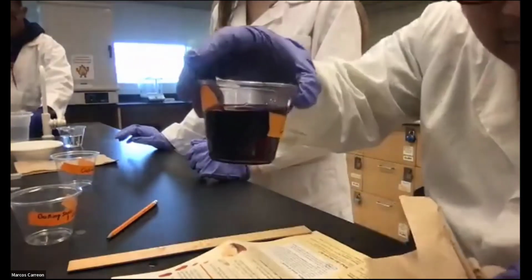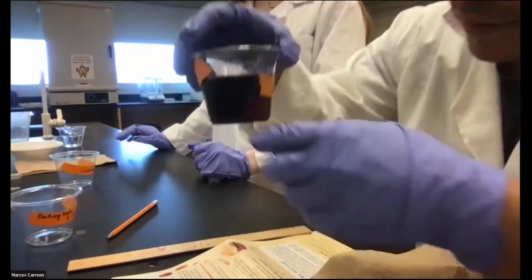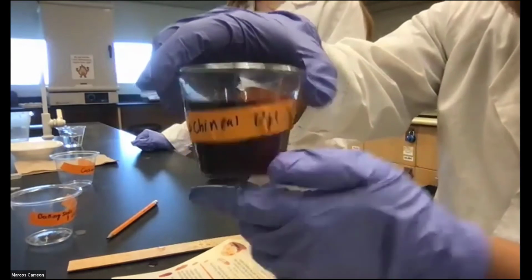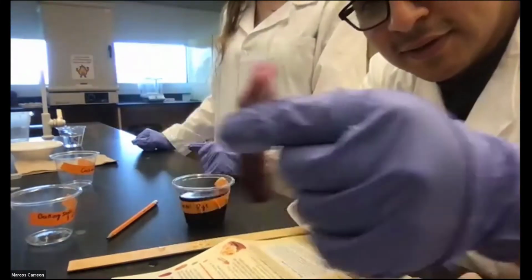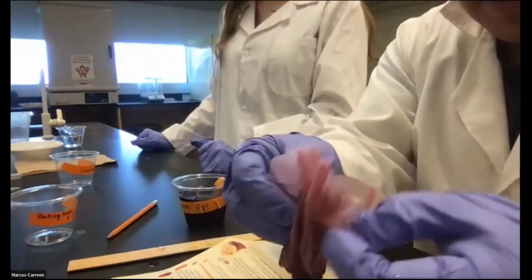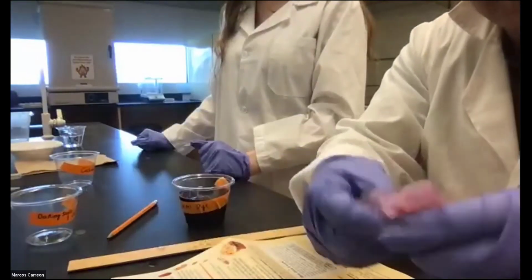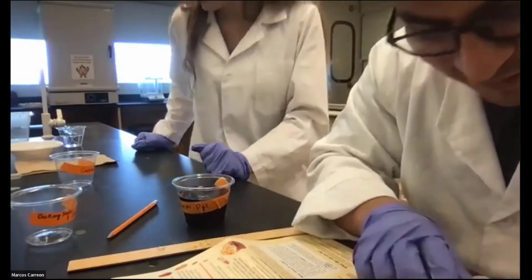And this is our solution with the indicator. So we have our solution with the cochineal. Again, we removed the bodies using this coffee filter. So I'll show you guys the inside. It kind of looks like ground coffee, if you kids are drinking coffee, but hopefully not. Maybe the teacher.